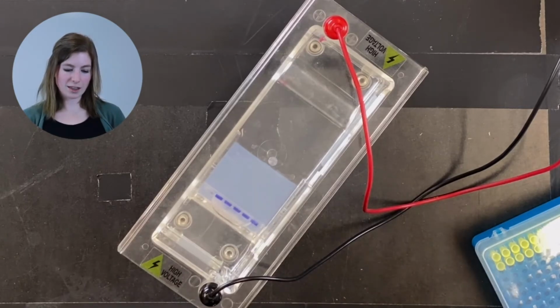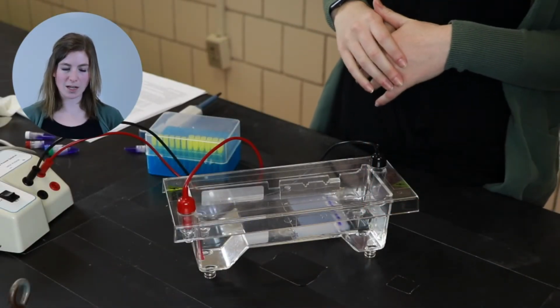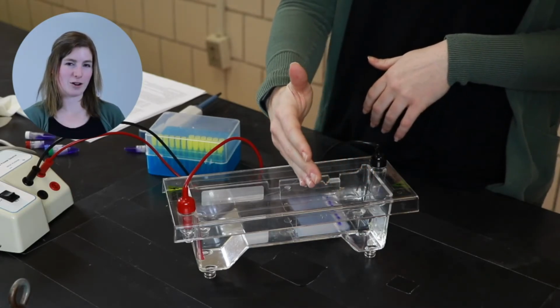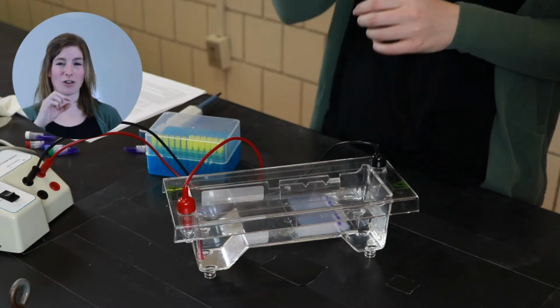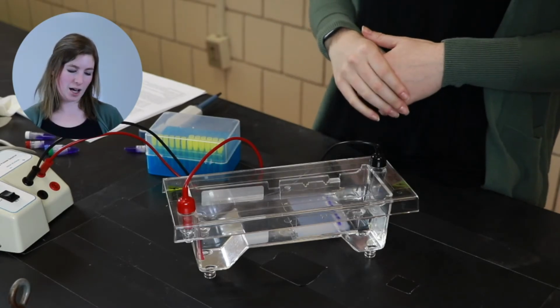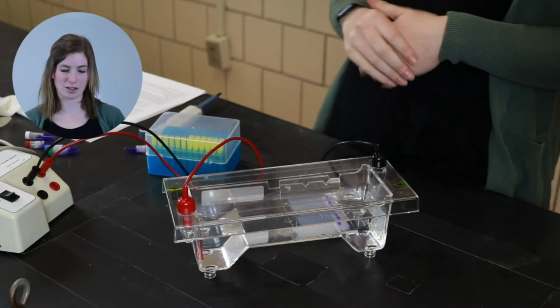And so if I were to let this run, I would let it run for probably about 35 or 40 minutes. I'm going to actually see the purple bands start to move down the gel. And that tells me that my sample is moving down the gel. What I won't be able to see is all the other DNA bands that are moving at that same time. But that's what I'm going to see when I put it on the UV light. That's the part that I'll actually get to look at.